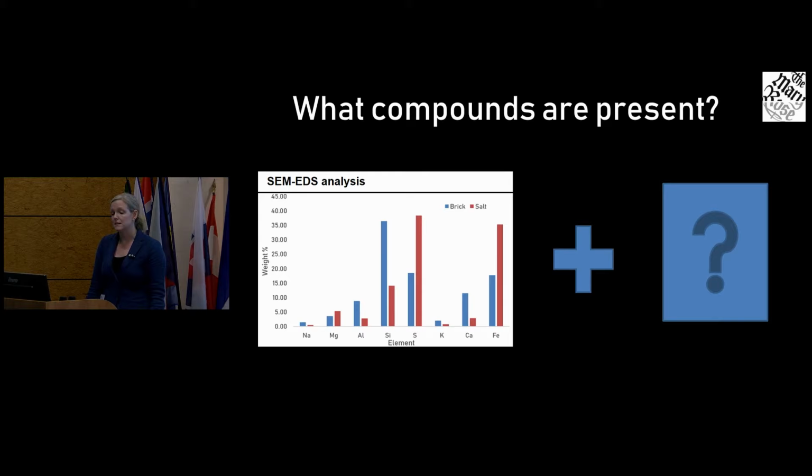What's interesting is that the conservation treatments done on these were cascade washing to get rid of sodium chloride, because that was known to be there. Nothing was done for sulfur and iron because it wasn't known that they were there. These treatments were done back in the 70s and 80s. We did some lab XRD, but because there are so many different phases there, you didn't get the resolution to deconvolute what was there. So again, a few weeks ago, we went to I-11 at Diamond Light Source and did some diffraction there. We're just figuring it out at the moment, and I don't have the data yet to show you, but hopefully next time I see you all, I will.